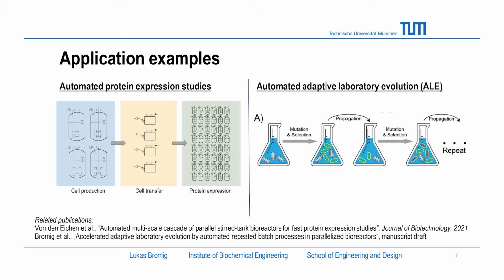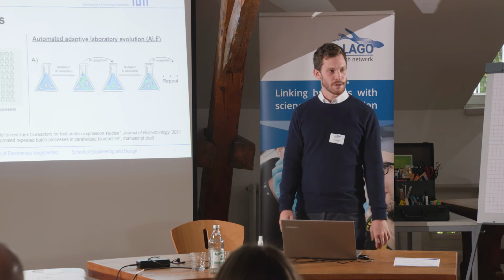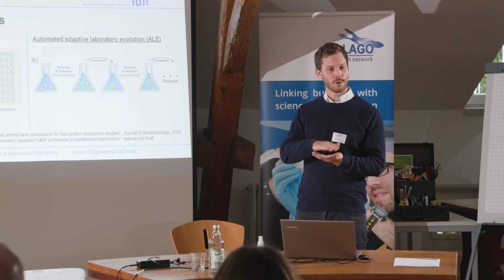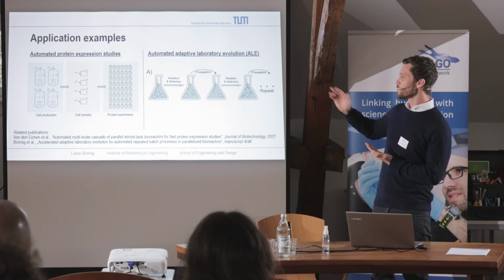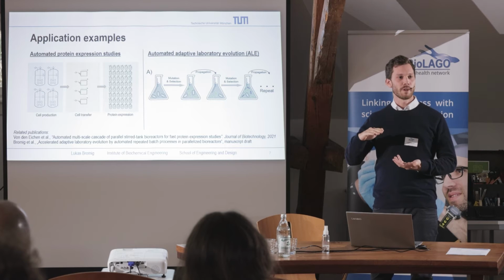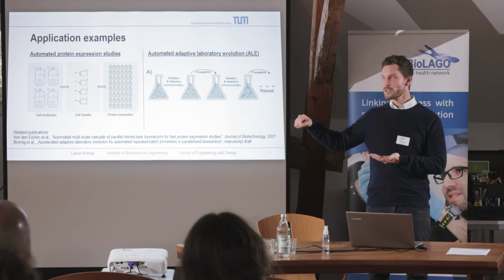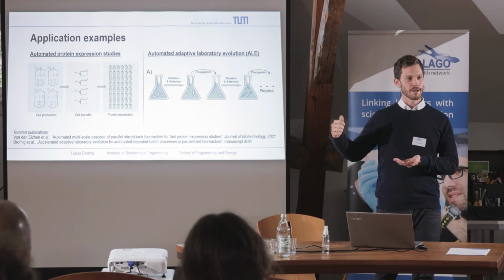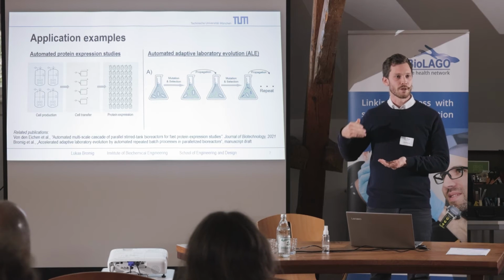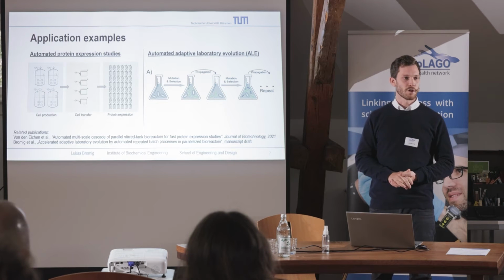And on this pipetting deck, we had a 48-fold bioreactor on the milliliter scale with specifically fitted sensors that measure DO and pH. So we had about 7, 8 different devices that all had to communicate, because at a certain time we used those larger scale bioreactors to produce biomass, and at a certain time we want to transfer that onto the pipetting robot deck, distribute it between all the 48 different small scale bioreactors, and then do induction experiments and check how much protein is being generated, and measure protein concentration and so on.